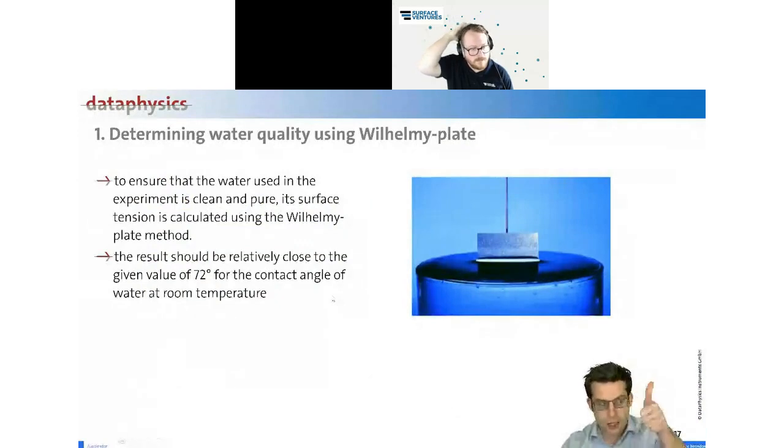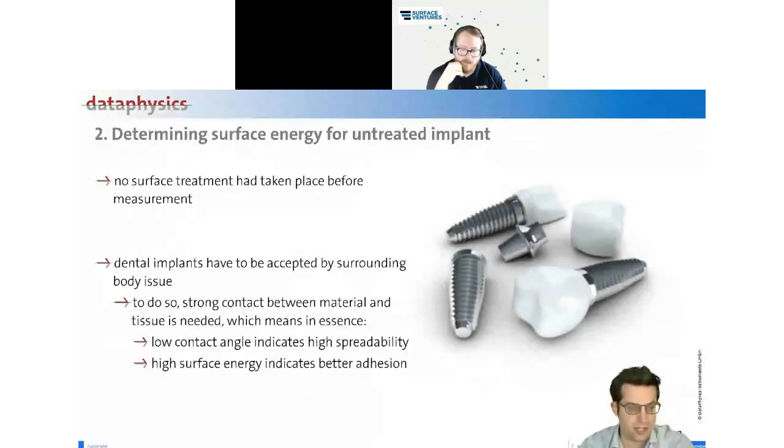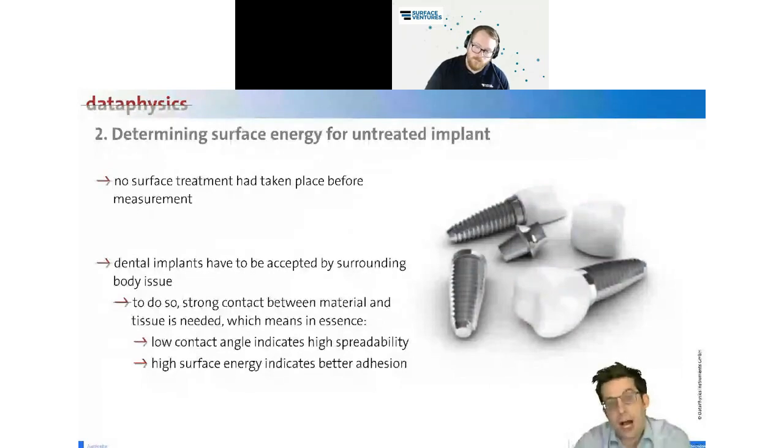So we completed our first mission. We have made sure we are using pure and clean water. This means our literature value is correct for the surface tension. Then in the next step, I have measured with you one tooth implant. The tooth implant that I have measured with you was a hyperhydrophilic implant. So you have seen the contact angle is 0 and a very, very significant imaginary contact angle was measured. Remember again, the higher the imaginary contact angle, the more wettable is the substrate.